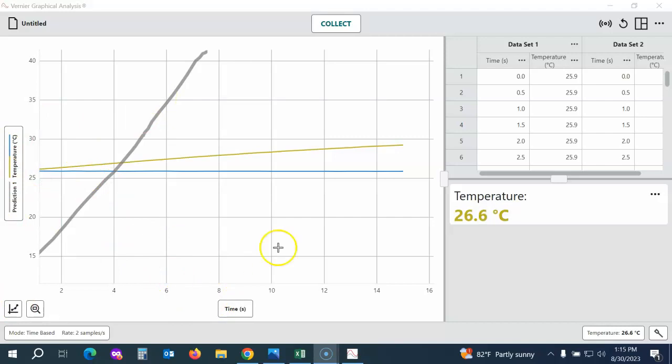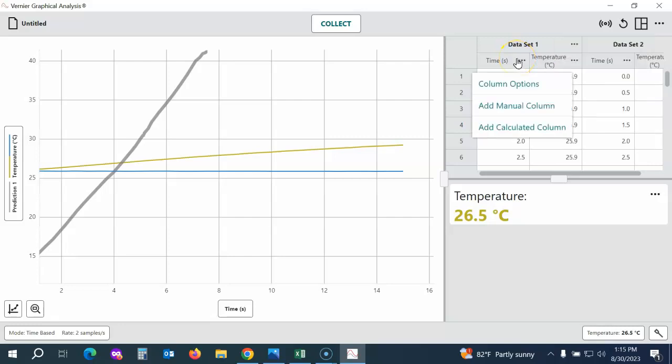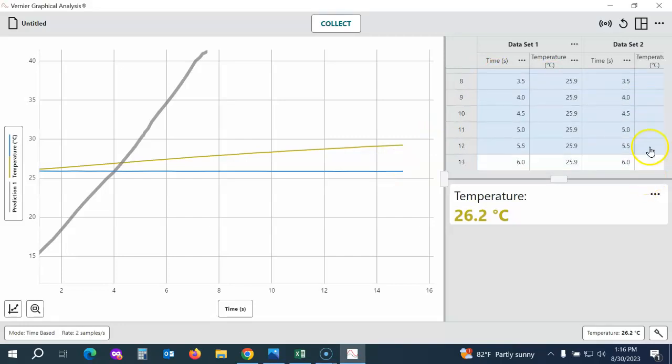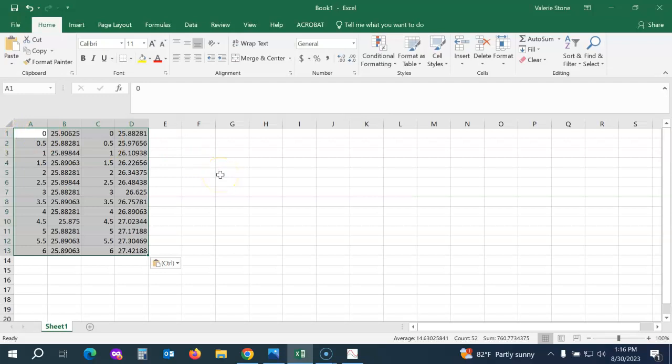If you want to change the labels on your x or y-axis, come over to your data table — accessed using the button in the upper right corner. Click on the little dots next to the column headers, choose Column Options, and that's where you can change the labels. If you'd like students to analyze the data individually, you can copy the data by clicking and dragging to highlight, then paste it into a spreadsheet. Students can share the data with the rest of their lab team, and it also works great for students who are absent or working remotely.